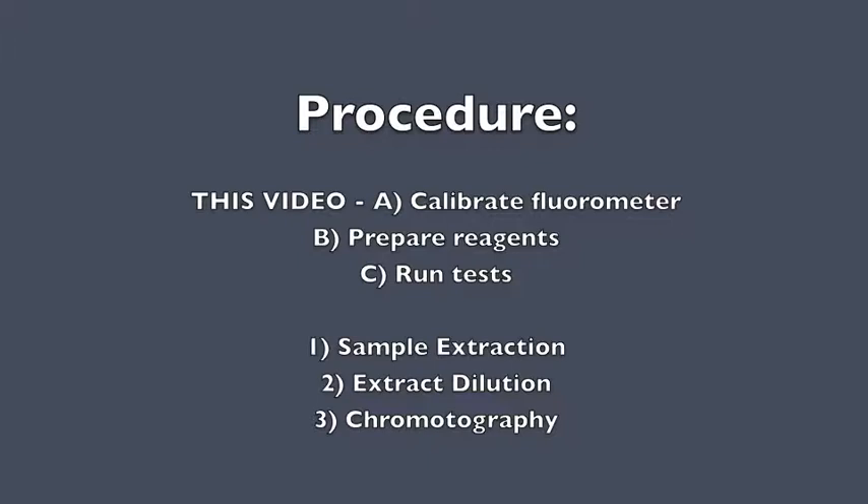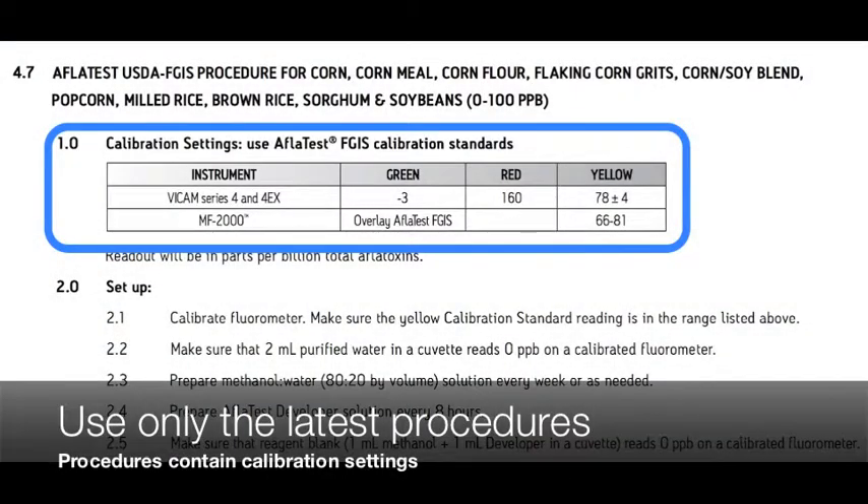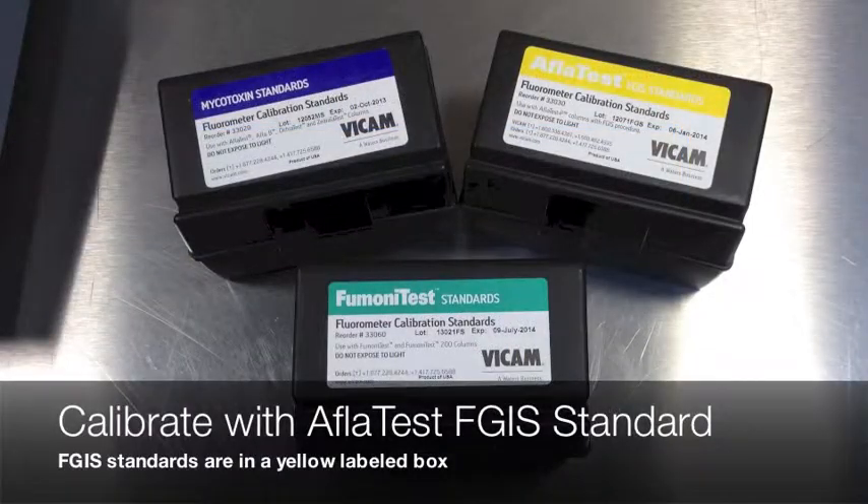Your fluorometer should be calibrated at least once per day. Calibration settings are subject to change. Use only the current procedures manual provided by Vicam. For the AflaTest FGIS procedure, use the yellow labeled standards box. Check the expiration date on your standards before proceeding.